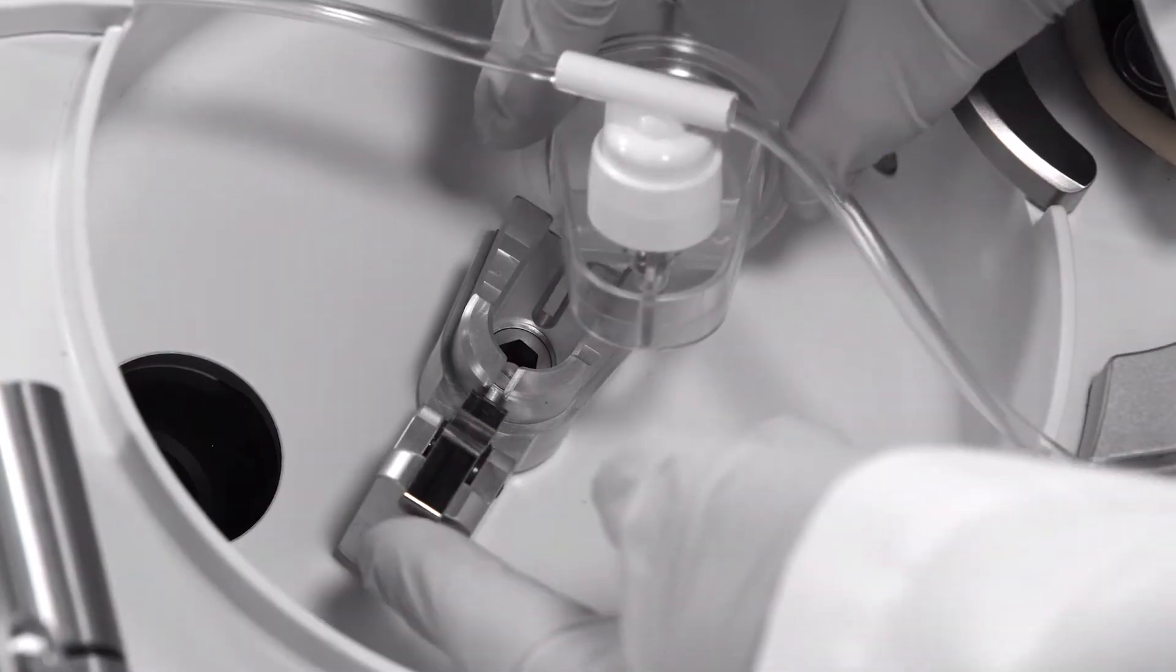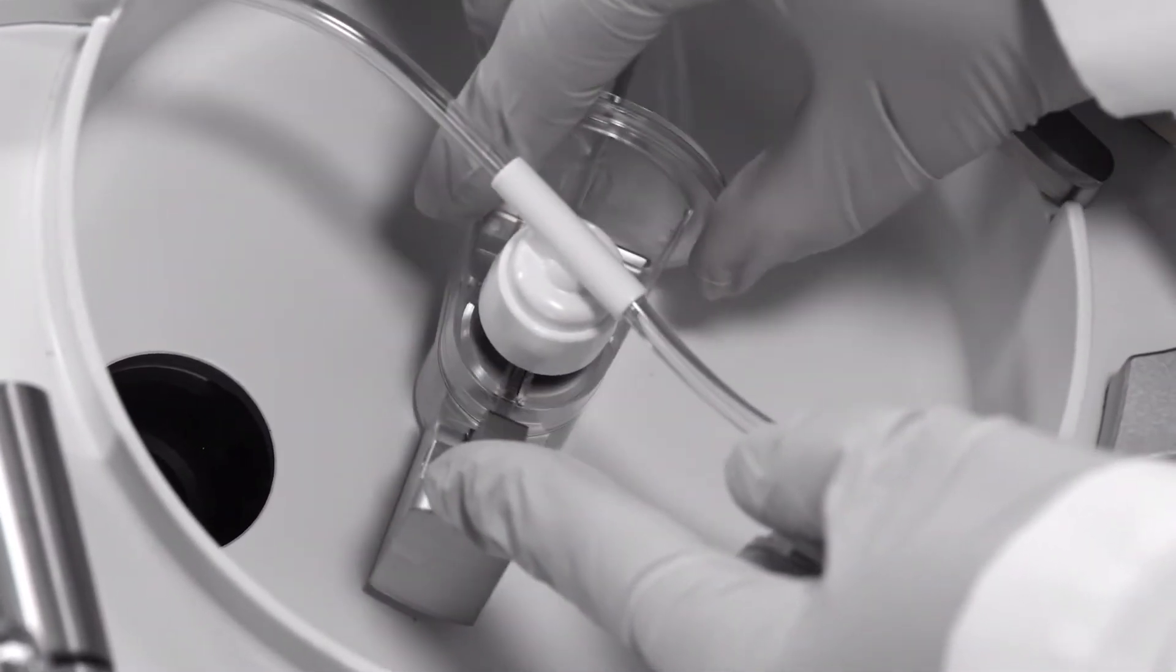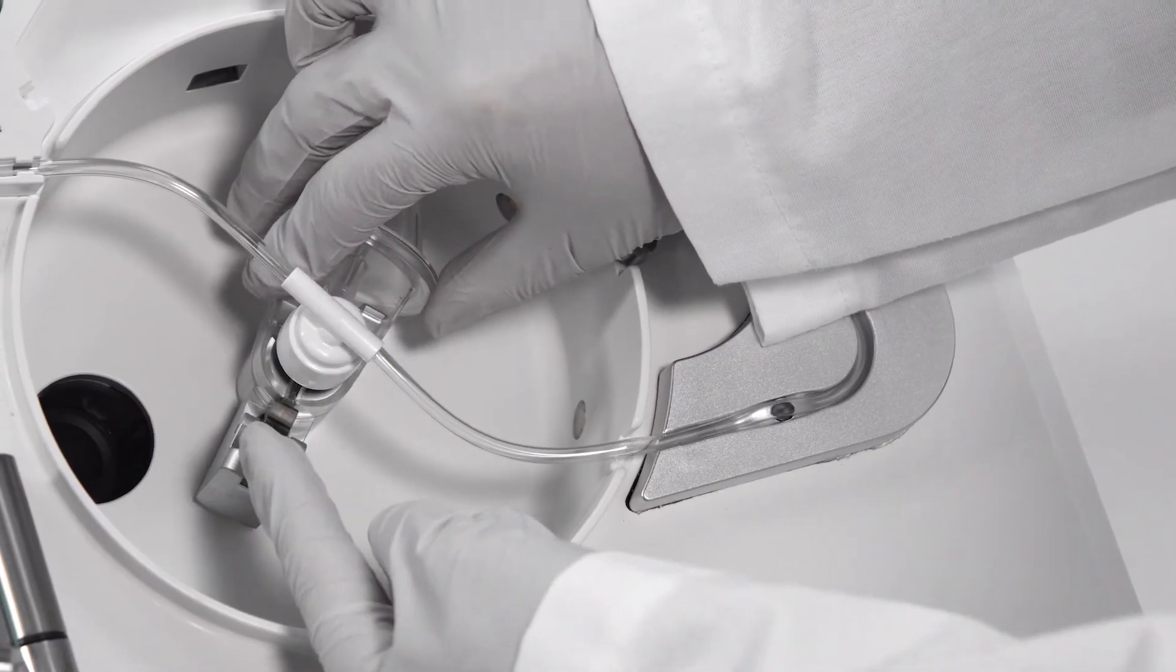Attach the centrifuge chamber or cone by lifting the silver lever in the chamber carrier and securing it by returning the lever to its upright position.